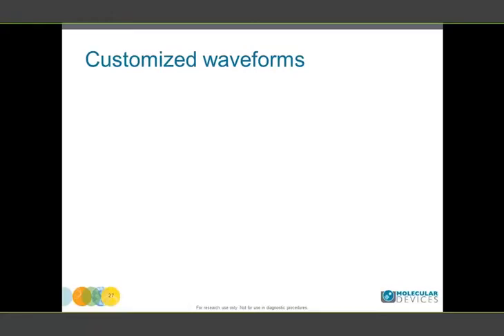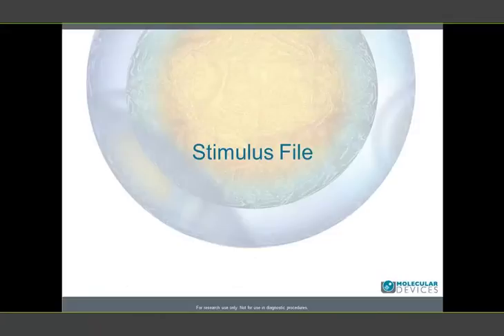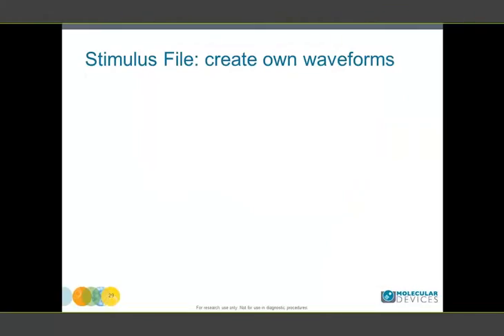Now let me get back to my presentation. Now, I mentioned about the user list. Now, how about the stimulus file? Okay. Now, stimulus file is one of the features that I like a lot, and I know that a lot of customers, they don't know how to use it. And basically, stimulus file can create your own waveform.